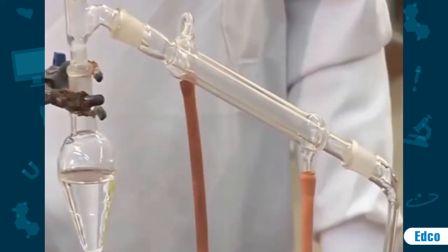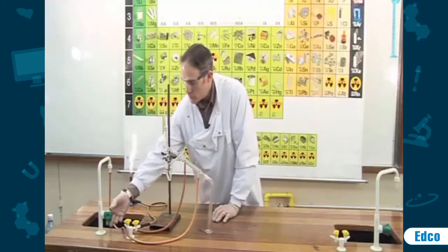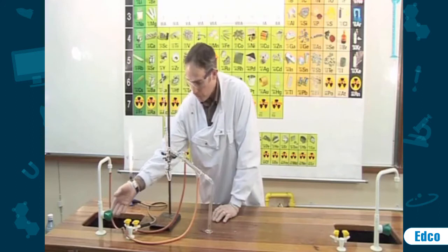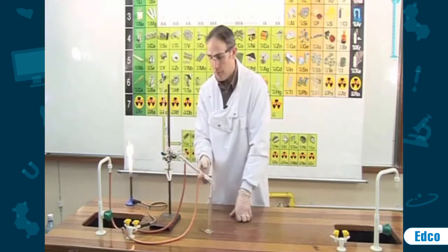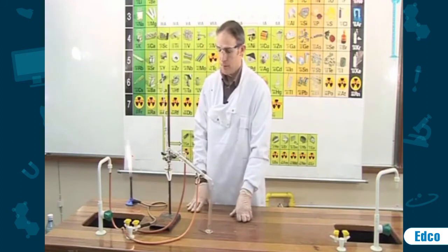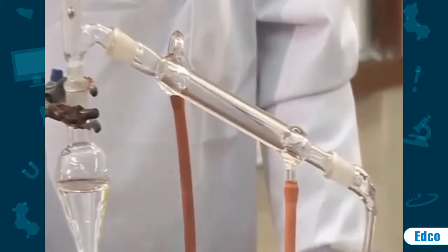Before we start, it is important that we switch on the condenser, which simply involves turning on the tap. The water will flow in the bottom, up through the condenser, and back to the sink. This flow of water ensures that the condenser is kept cool throughout the experiment.